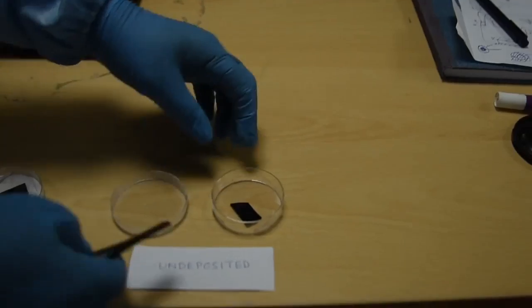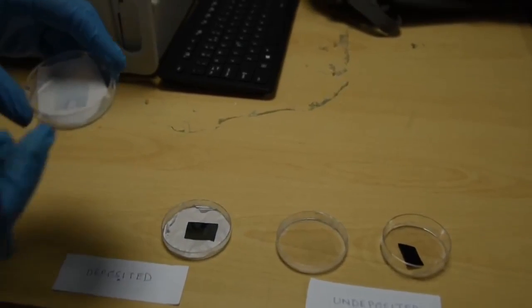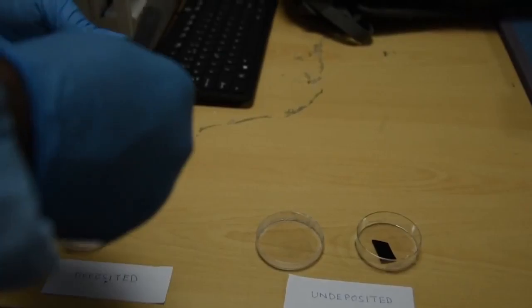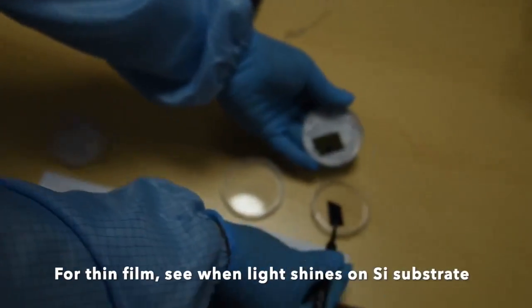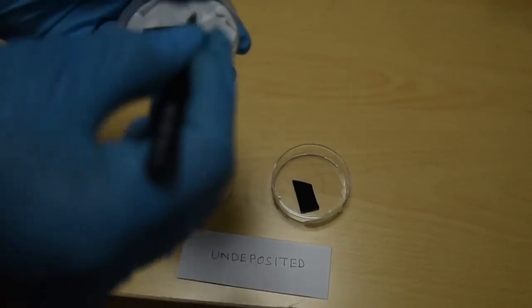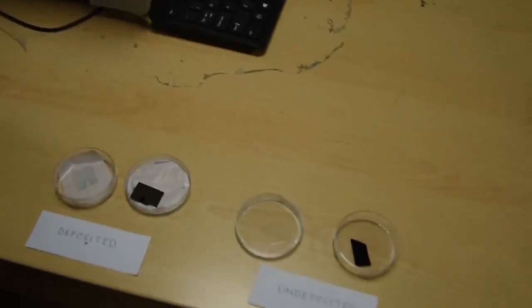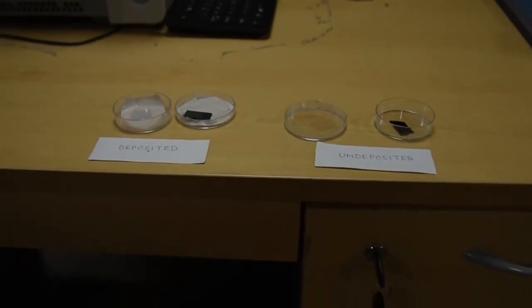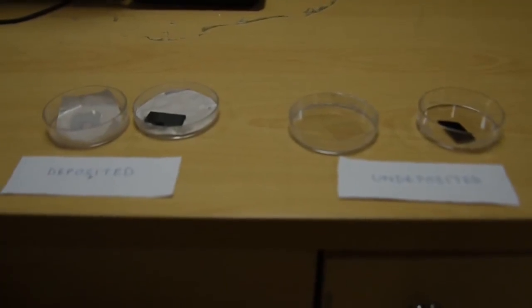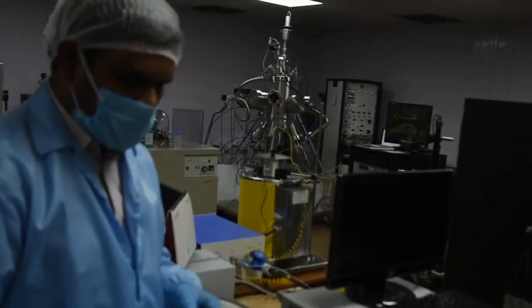Here are the deposited films. This is an undeposited quartz substrate and this is an undeposited p-type silicon substrate. This is the sputtered deposited p-type silicon substrate and this is the sputtered quartz substrate. This is the mask that was placed on the substrate while it was on the substrate holder. The thickness of these films depends upon the RF power supplied — for example, 10 watts, 20 watts, 50 watts, or 100 watts — and also upon the pressure inside the chamber during deposition.